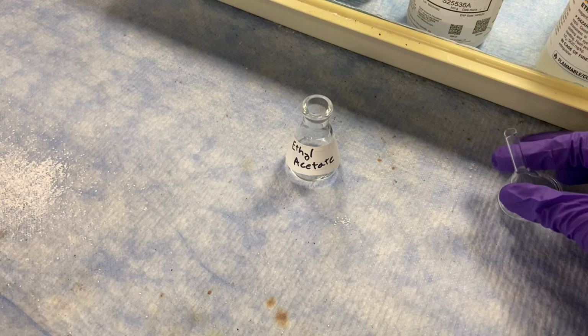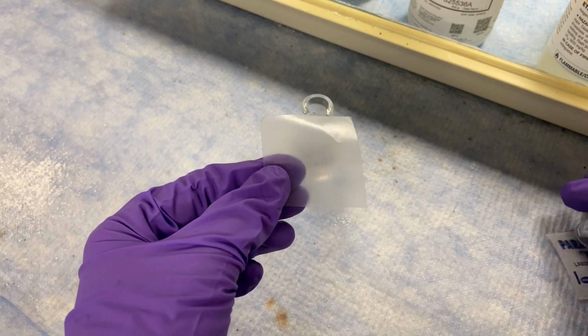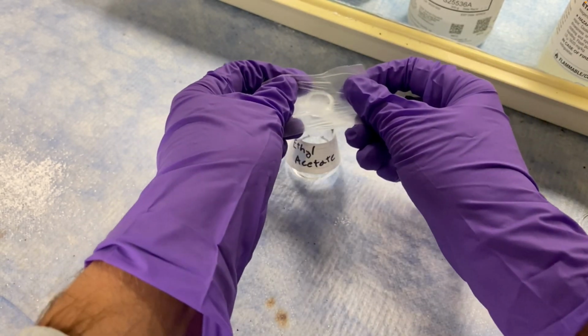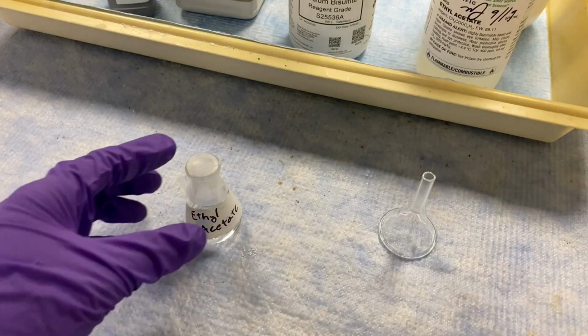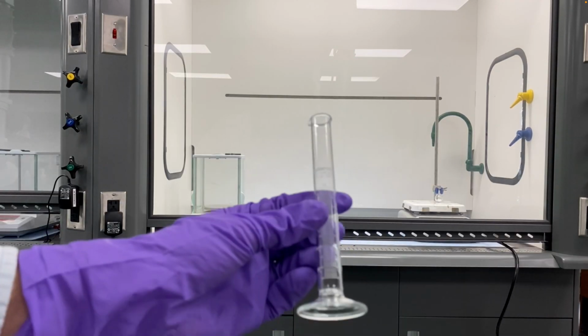And almost everything in the organic laboratory is toxic in some way. So to prevent you from breathing in any of these vapors as you carry this through the room, you use what's essentially industrial strength saran wrap, and that's called parafilm. So you take off the wax backing of it, and this sticks better to a container when you stretch it a little bit. Then put it on top and press it around the neck of that flask. Then you can take that and the short stem funnel back to your fume hood.